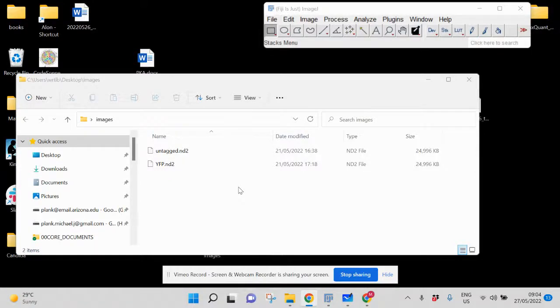I decided to make a short video about how to adjust microscopic images to the same intensity or brightness scale. This is an issue I struggled with that I found annoying and where I didn't find any good resource. I acquired images using the same microscopic settings — the same exposure time and the same light intensity — and now I want to put them in a figure where they are directly comparable, so cells with more fluorescent protein actually show up brighter.